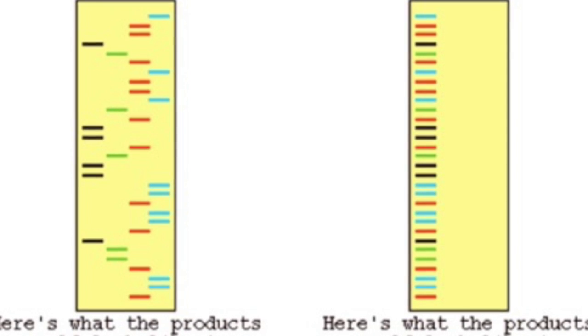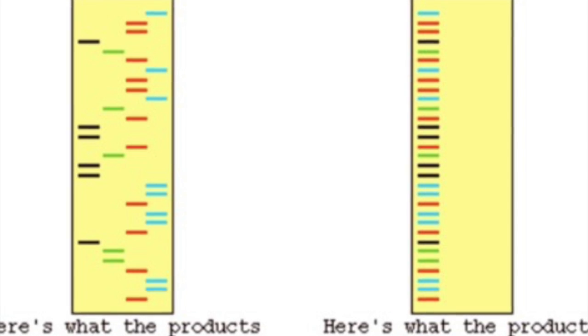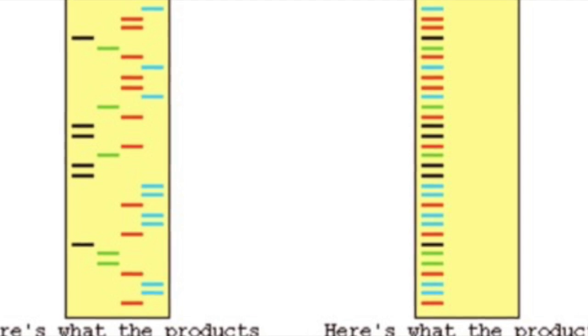In automated sequencing, the oligonucleotide primers can be labeled with different color dyes, for each ddNTP. These dyes fluoresce at different wavelengths, which are read via a machine. As in Sanger's method, the DNA is separated on a gel, but they are all run on the same lane as opposed to 4 different ones.